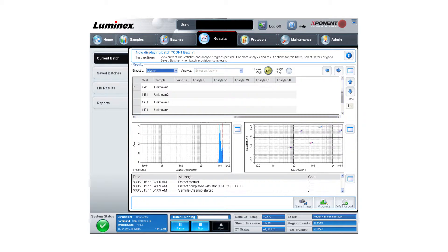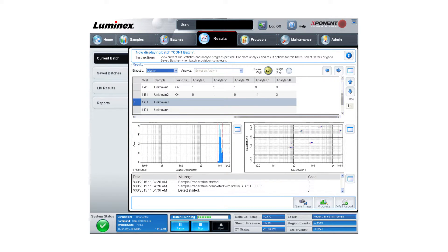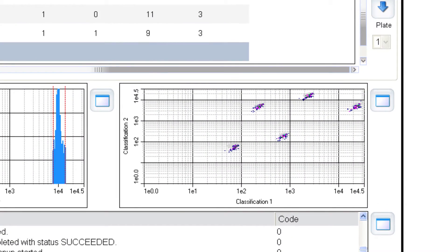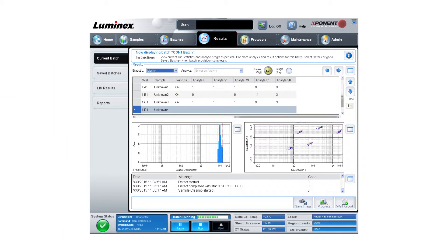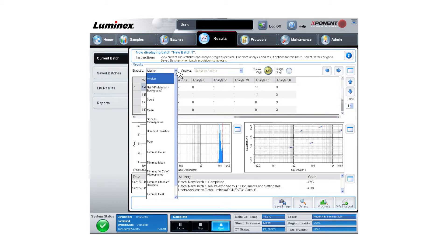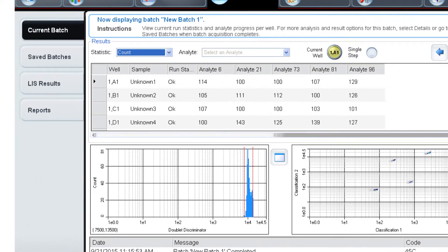The last step is to analyze the results. A successful run will show the microspheres populating in their corresponding regions on the Exponent beatmap. Please note, no MFI signals will be seen when running this reagent as an assay. Once the assay is complete, the results can be viewed in the exported .csv file or in the results page by changing the statistic to count.